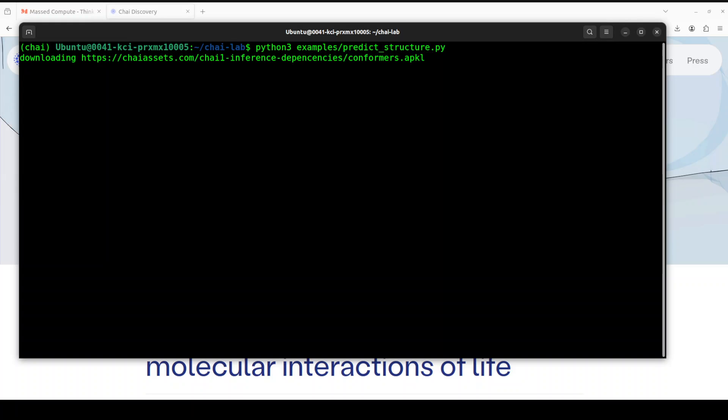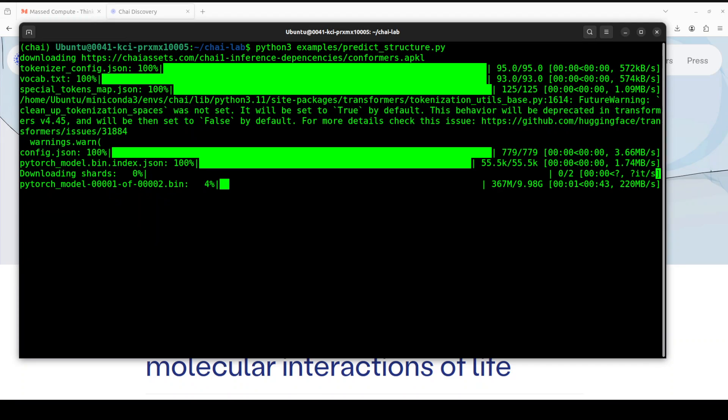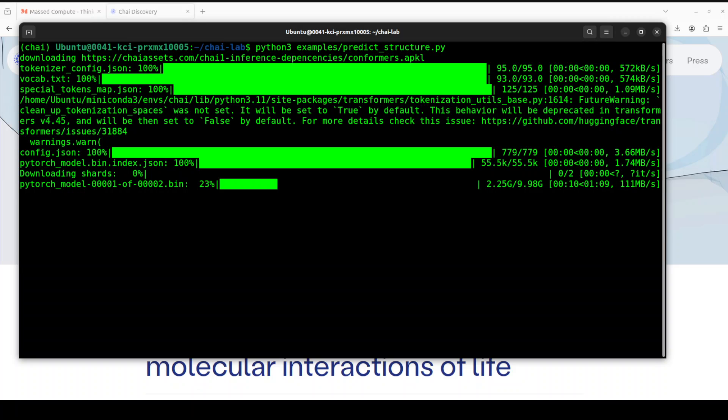And it is going to download some of the dependencies. That is going to take a bit of our time. And then it is going to download the model. As you can see, there are two shards of it. The first shard is just under 10 gigs, so let's wait for it to download. And the second shard is quite small. That is good.